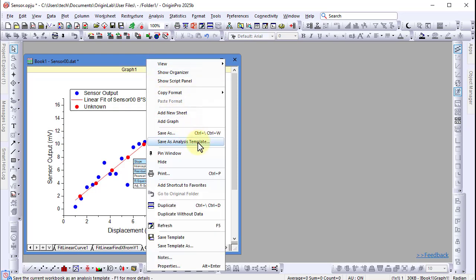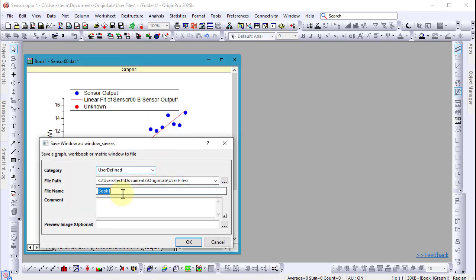Now this workbook, which contains our analysis as well as our graphic data, can be saved as an analysis template, which allows us to send other files through it to receive the same analysis and visualization.